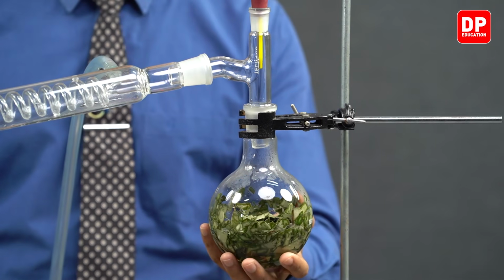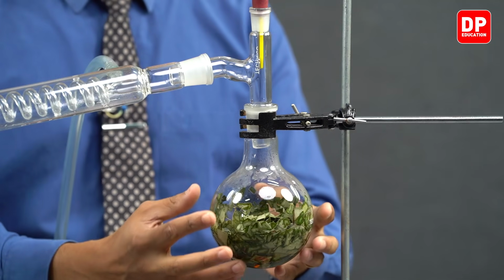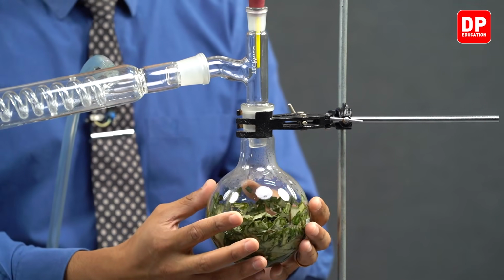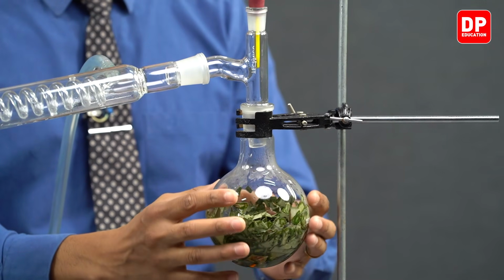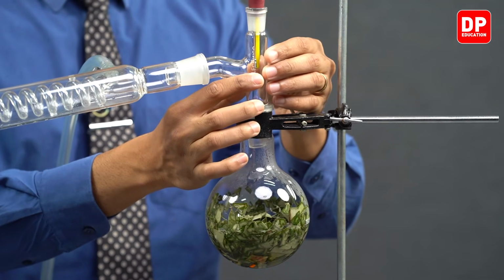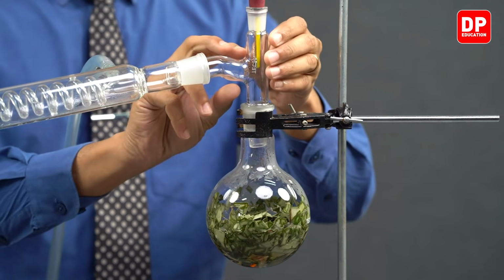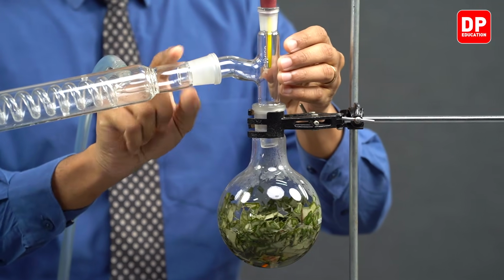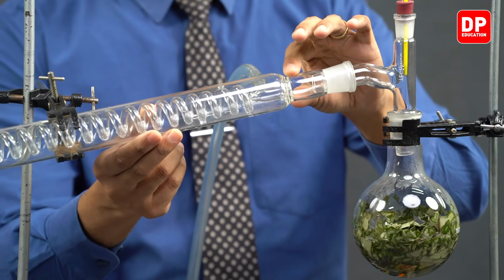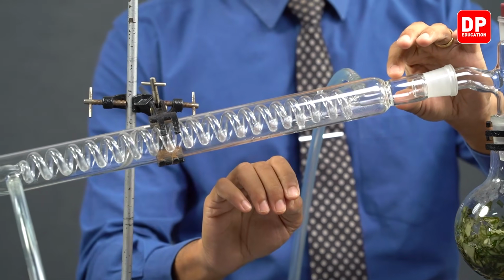So students, this setup is used for, first of all, heating the water and releasing the essential oil, and the essential oil and water vapor mixture will rise to the top, and at this point we will be reading the temperature of this gaseous vapor mixture. And with the use of the three-way adapter, the produced vapor mixture would be directed into this condenser. This condenser is also known as a Graham condenser.